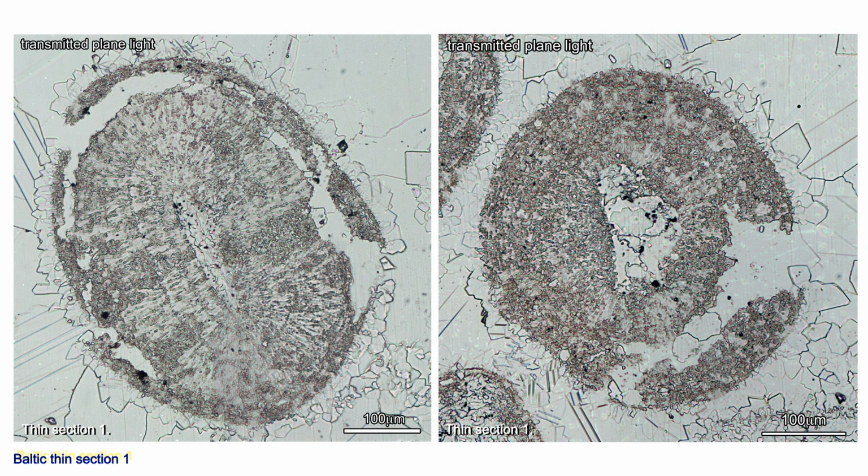These moth-eaten looking ooids with irregularly shaped cavities are found side by side with ooids that have no cavities. The smaller cavities in the ooid's outer cortex do not distort its fabric, while larger cavities have expanded away from the ooid's centers, giving the grains an exploded look. They formed by a combination of dissolution, then fracturing. All the cavities contain only cement B crystals.